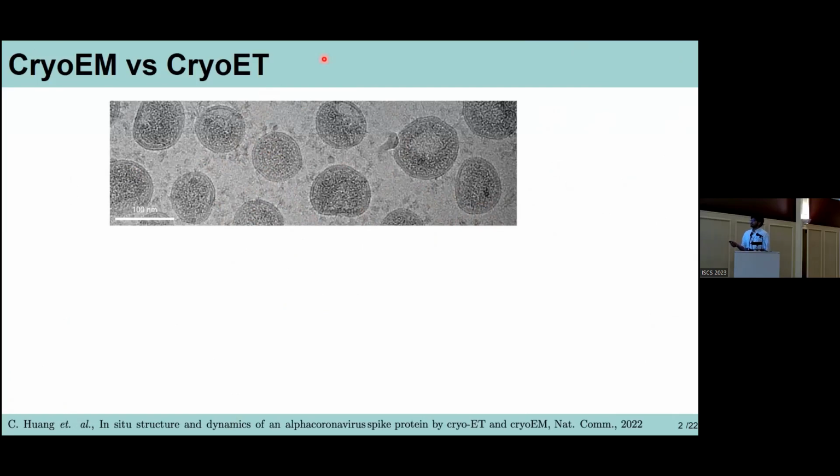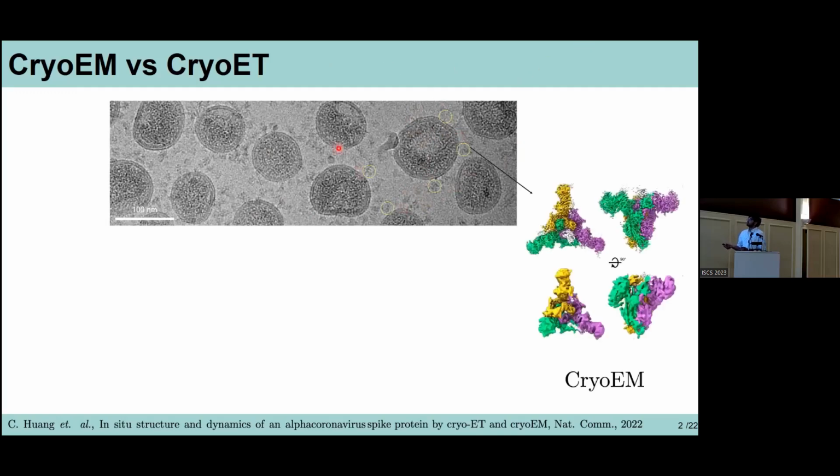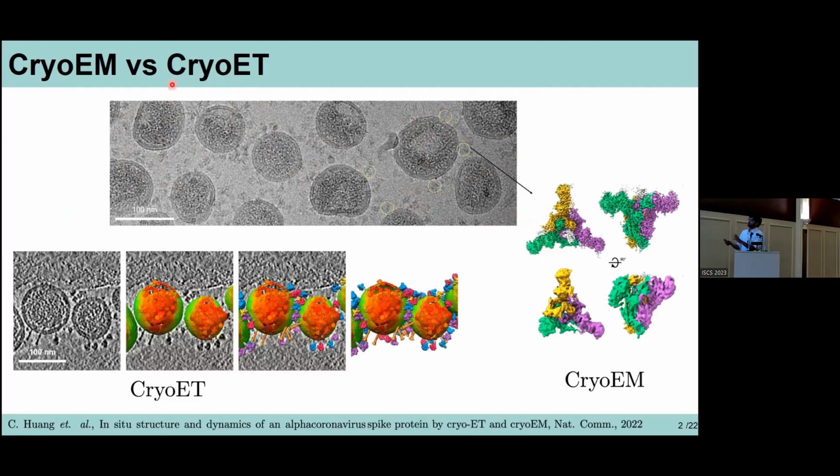Typically in cryo-EM, people look at smaller structures and try to reconstruct them in a much more detailed way. You take these smaller structures, which are repeated throughout the projection, and stack them and perform cryo-EM reconstruction. But here we'll try to look at the reconstruction as a whole, so you try to recover the entire 3D structure of the volume itself.